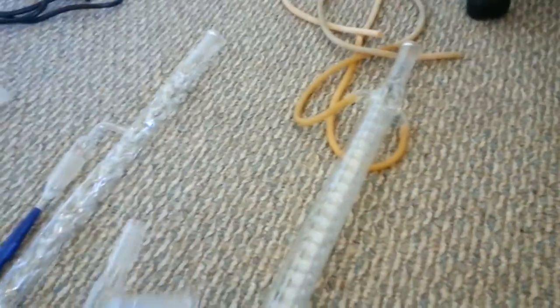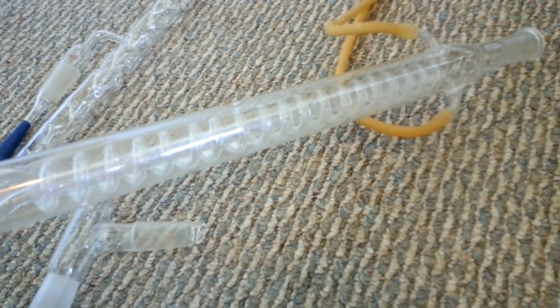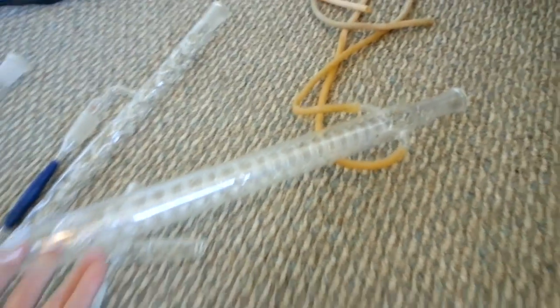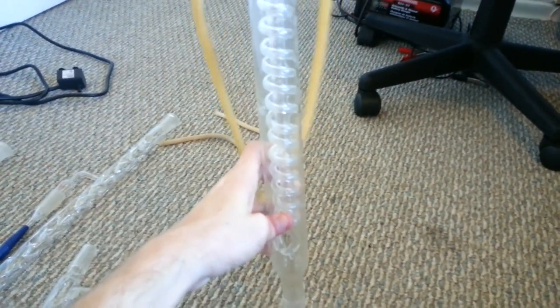This is probably my favorite item — it is a reflux condenser, and it's so nice. It's got two tubes: water goes in one of them, goes down the thing, and travels in a spiral. Steam comes in one end, travels down and condenses on the coils, and then liquid comes out. You can get a lot of different kinds of condensers — some are air-cooled, some are water-cooled. I prefer this one; I got a huge one and just went all out on it. I find it's perfect for pretty much all of my needs. You can set it up for reflux to keep vapor from boiling away, or for condensation — I'll get to that in later videos.